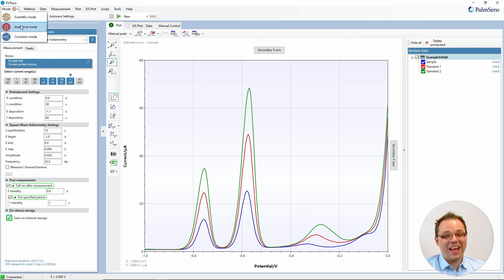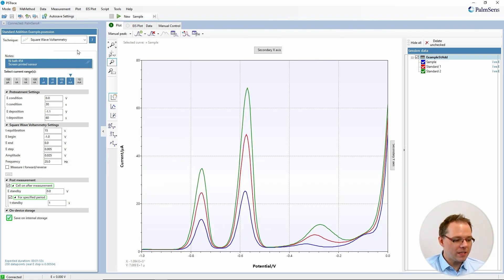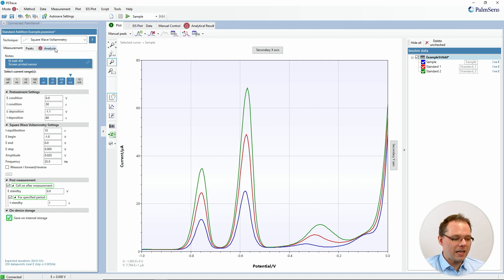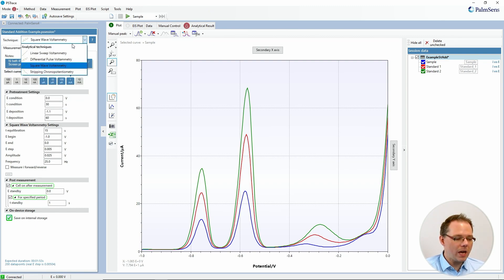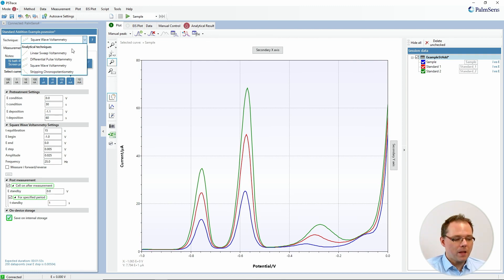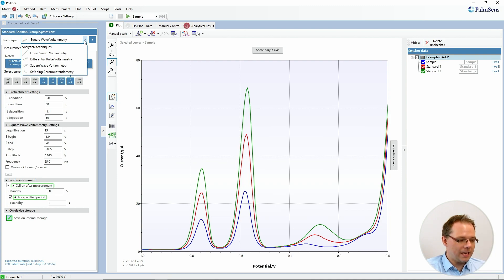There will be a separate video for that. So let's switch to the analytical mode. Two things happen when you switch: you have a new tab here and you have another new tab here. Another thing that happens is you have fewer techniques available — we only put techniques there that allow you to get peaks, and using these peaks to do your calculations, as you will see in a minute.